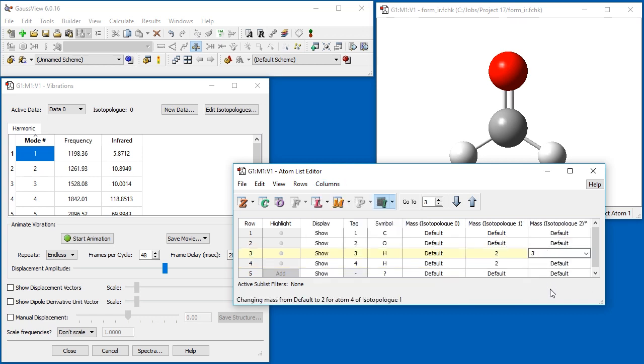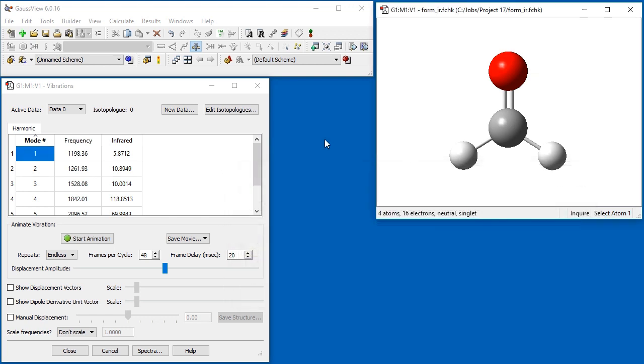Here we demonstrate setting up isotopologues 2, which substitutes tritium for one hydrogen atom. We close the atom list editor and return to the vibrations dialog.